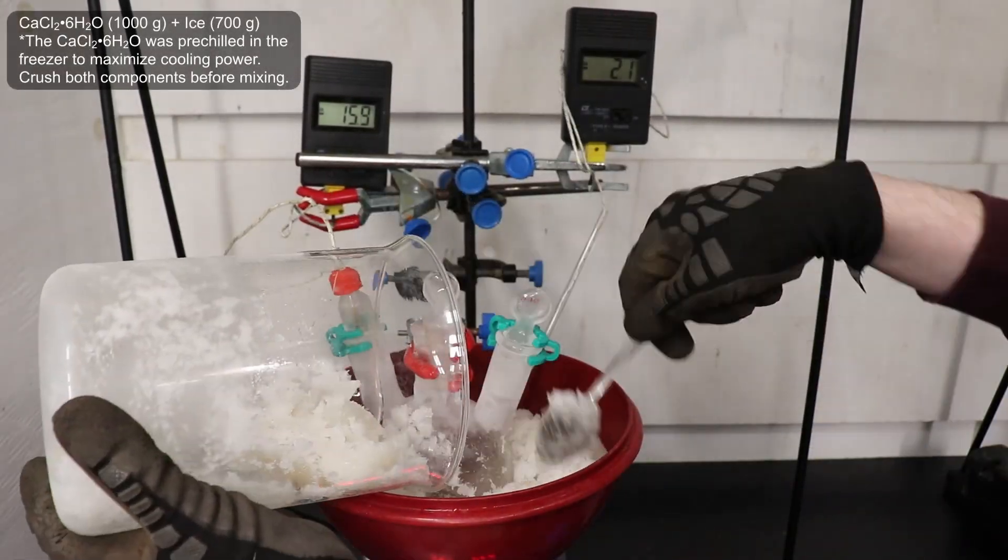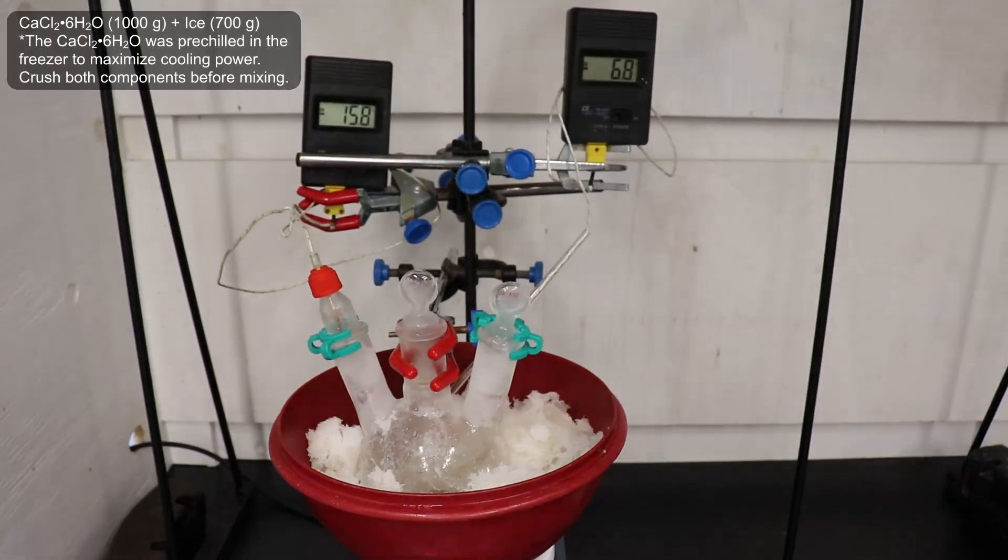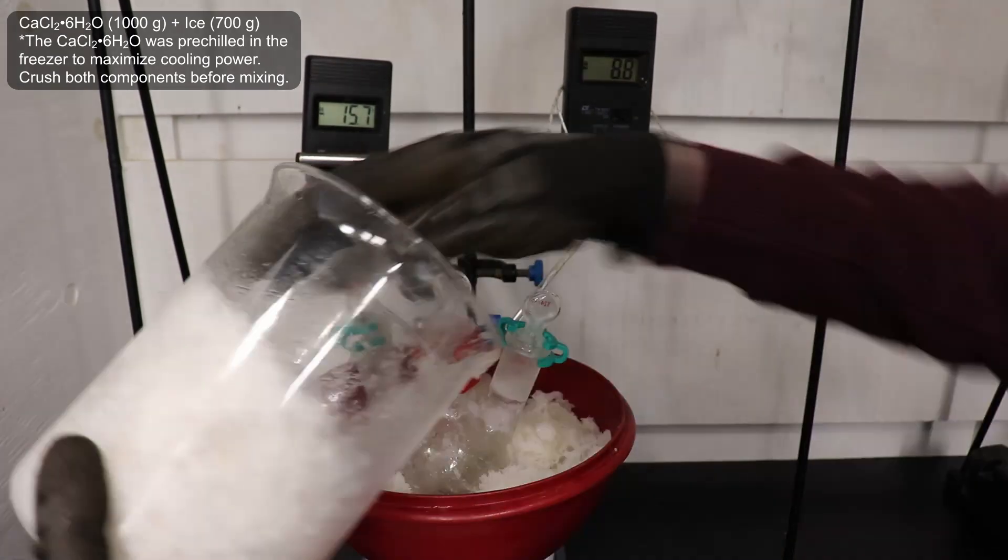I took the flask out of the freezer and placed it in a large bowl. To this bowl, I added 1 kg of calcium chloride hexahydrate, which I had pre-chilled in the freezer, and 700 g of ice.